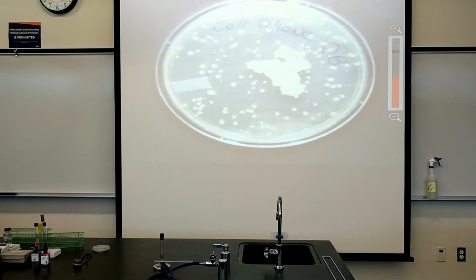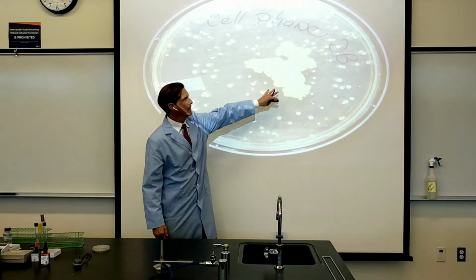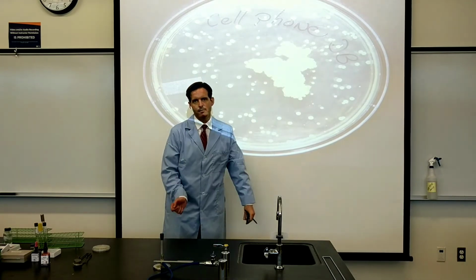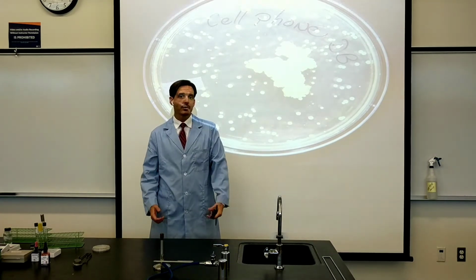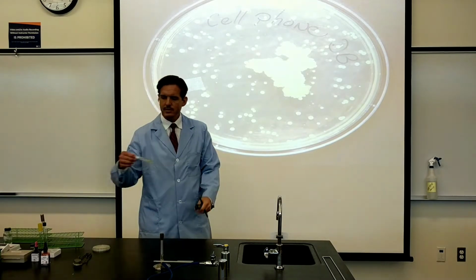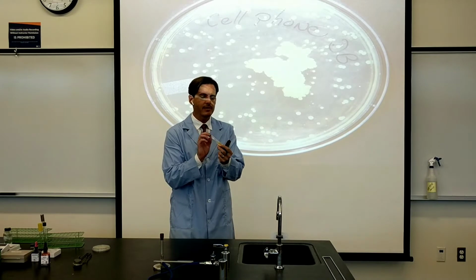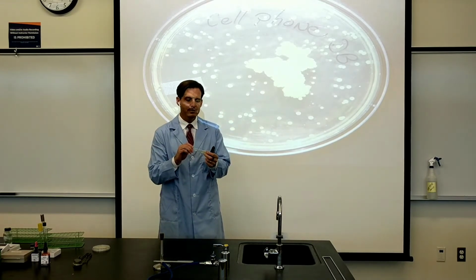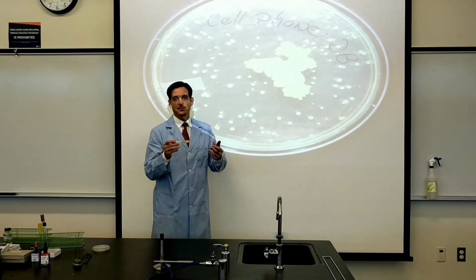And speaking of a broad look, you can see all around, situated around this weird waxy one, that there are all these fairly similar looking colonies of bacteria. And those are what staph bacteria look like. One of the staph that we're going to be using today is called Staphylococcus epidermidis. And Staph epidermidis growing in this slant is the most common skin bacterium on all humans. So it's what it is to be human.